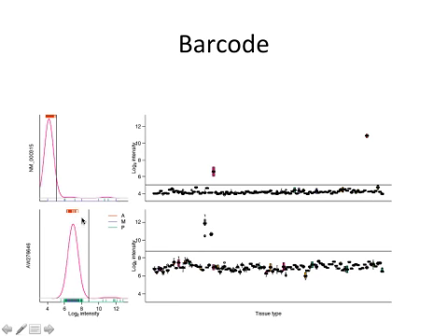So here they're calling all these absent. But then there's a lot of other ones that have the same value that are called present. It's kind of strange. And over here, all of them are called absent. I don't trust these very much. And I think this is what I'm showing with this picture.